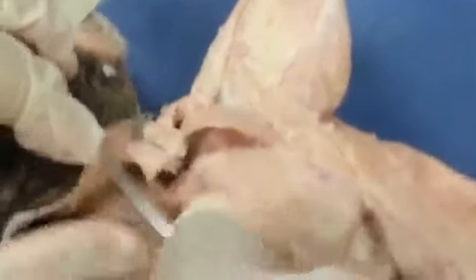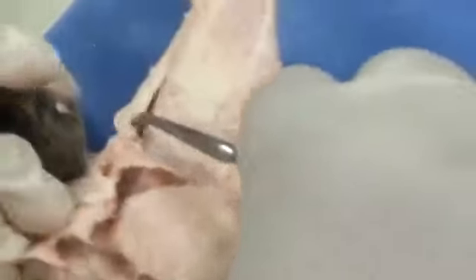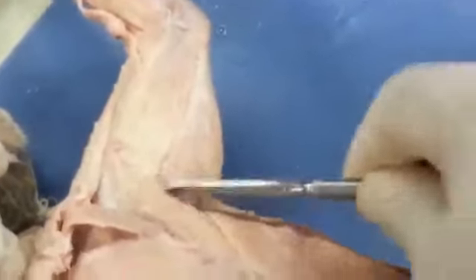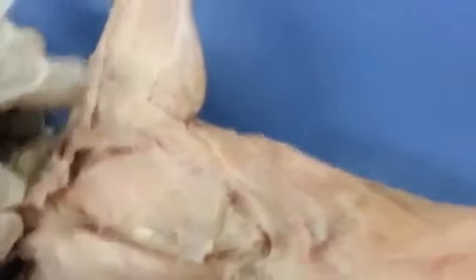Here's our levator scapulae ventralis, this band-like muscle that's going to elevate the scapula. Now, as we go lateral to this, you're going to see the deltoids, right? The clavodeltoid, the acromiodeltoid, and the spinal deltoid, which is this band here. Now, the main action for the deltoids is going to be to abduct the arm.